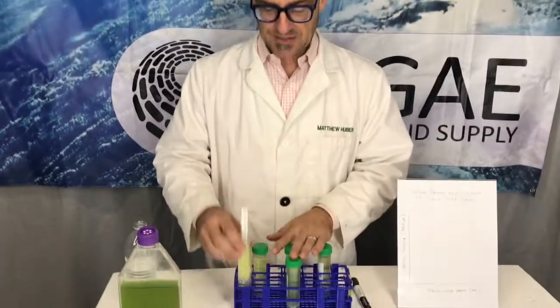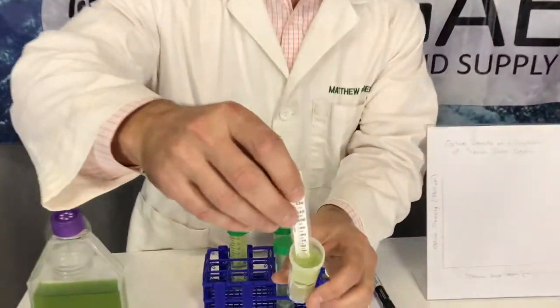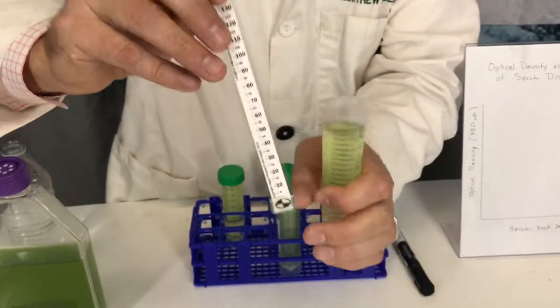Basically what you're doing is creating the relationship between one analytical instrument and another analytical instrument. The Secchi stick — we've gone over this in several different videos — it has a target.